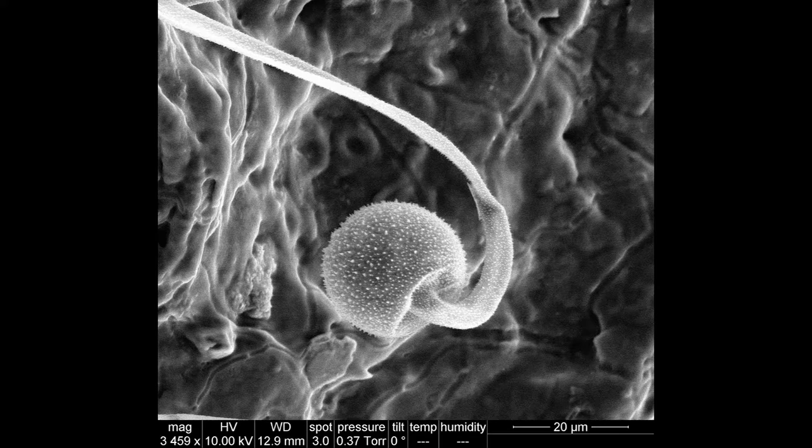Nick, a question? So what you're saying is seeds are cultivating and technically growing in food. Yes, that's what I'm saying. And since the sample is probably like a week or two old, it makes sense that they've grown a little bit too. It's not like the seeds grow inside the guinea pig. But once they poop it out, they can start growing.